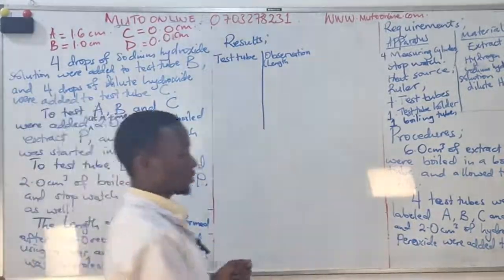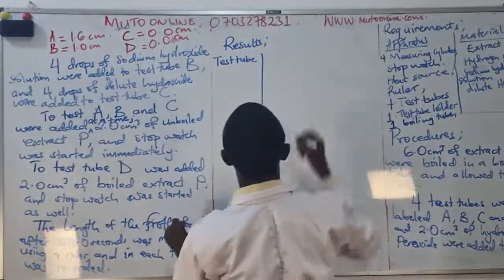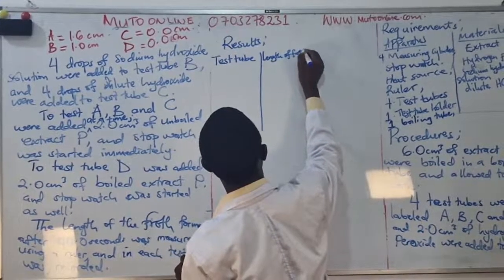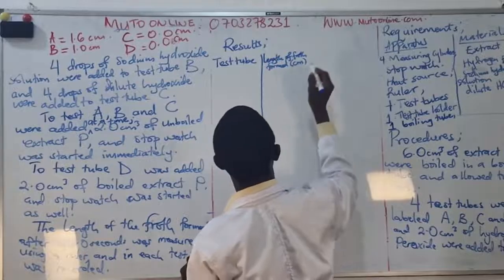My observation, I will not use yours. My observation was about length of froth formed. And the length is always measured in centimeters.